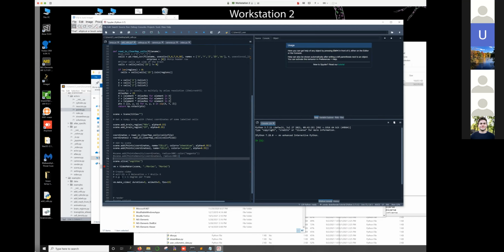And so I've actually put in some notes here. There's 3 sort of variables, azimuth, elevation, and roll. And that's going to determine how the brain is moving. And it's going to move 1 degree per frame. So you're kind of setting it up here. So here, if I say 5, it's going to move 5 degrees per frame. And I'm doing 15 frames per second, and I'm doing 3 seconds. So it's basically going to do 45 frames, and it's going to rotate 5 degrees for each one of those frames. And it's going to save it into a directory called movies, and it's probably going to be in this directory here for me. I mean, I can just quickly change this to desktop.